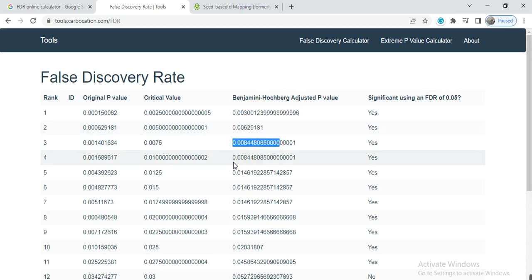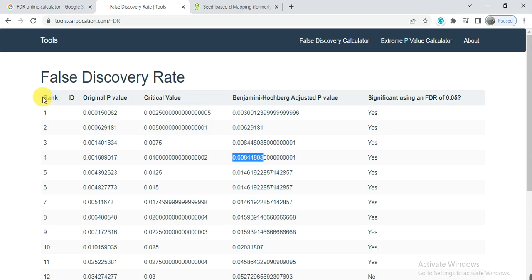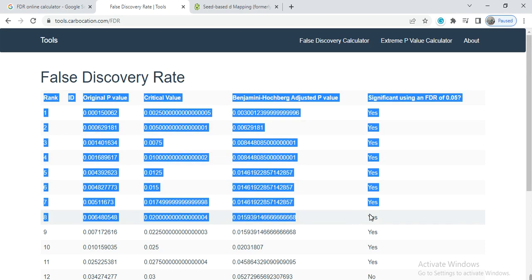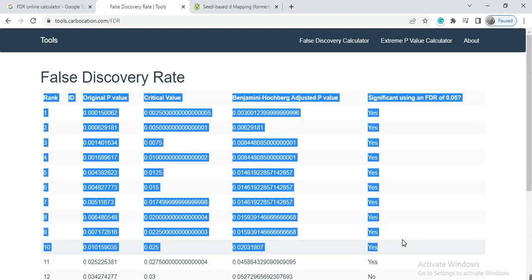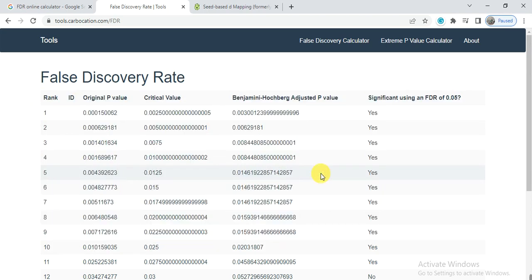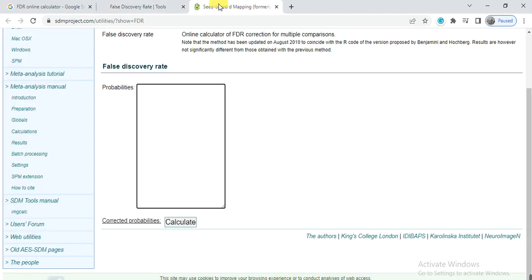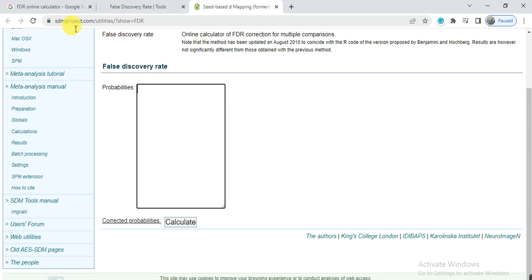These are the p-adjusted values of that p-value. You can copy one by one or all, hold that table and then paste it into your Excel sheet. The other method is another website.